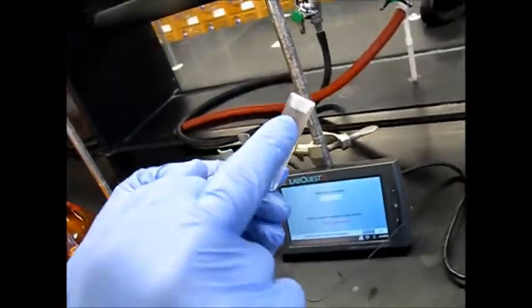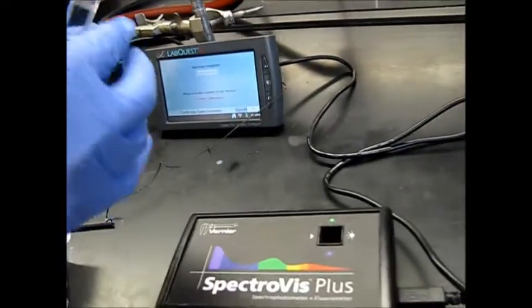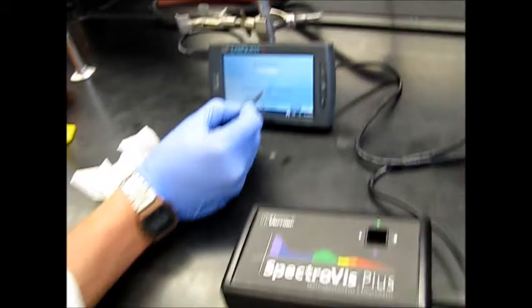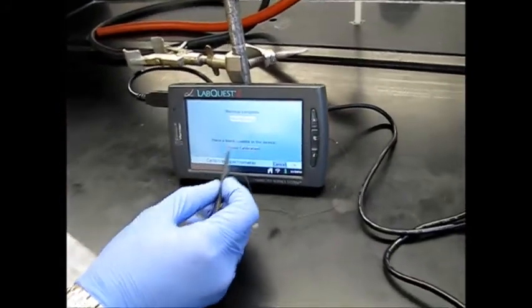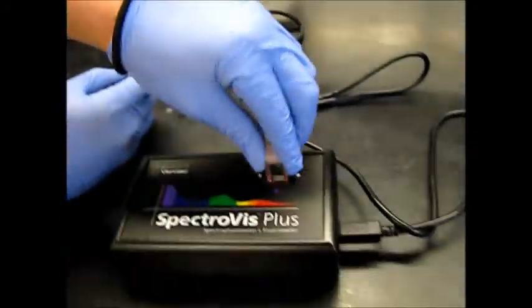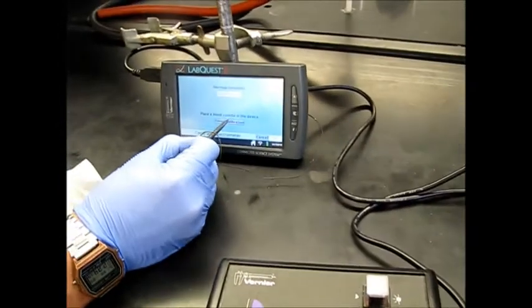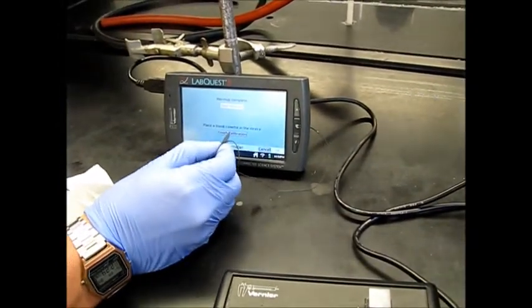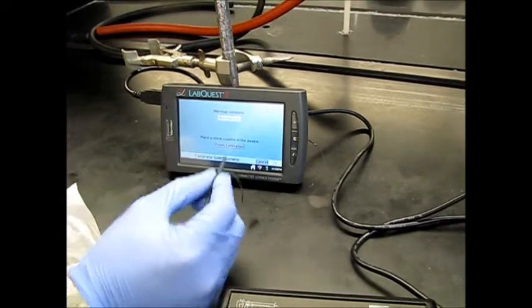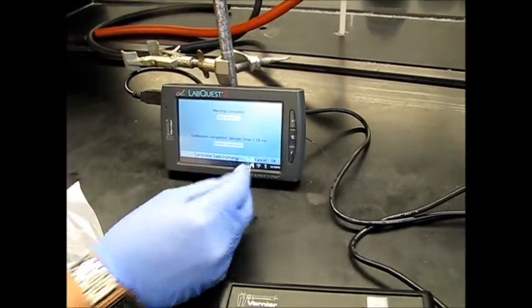I don't know if you're able to see, but there's a very small arrow right here. It'll line up with this arrow right here. So we're going to go ahead and click, so it says place blank cuvette in the device. Place it in like that, and then we'll finish the calibration. Awesome.